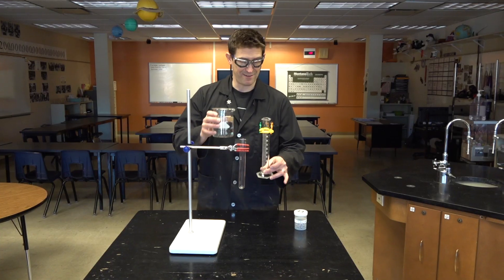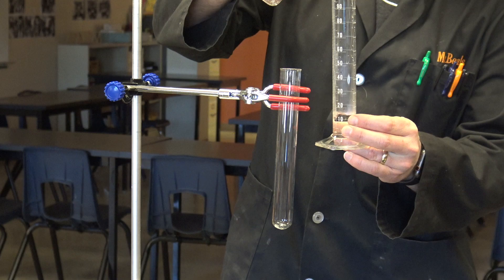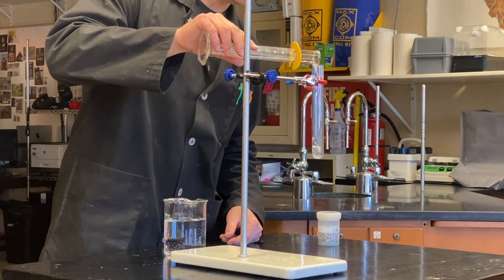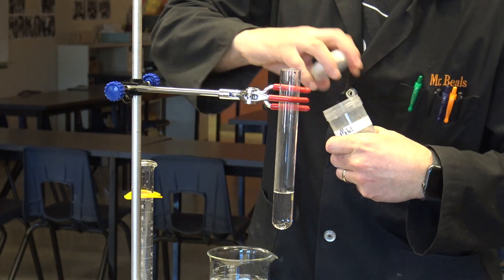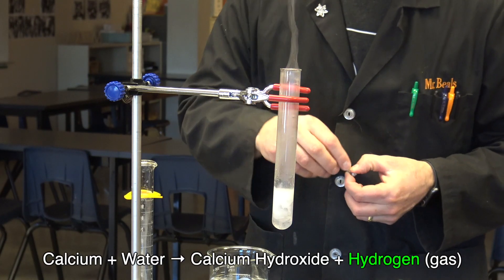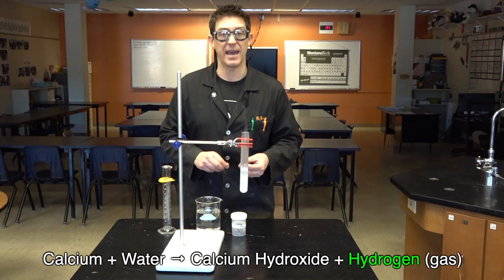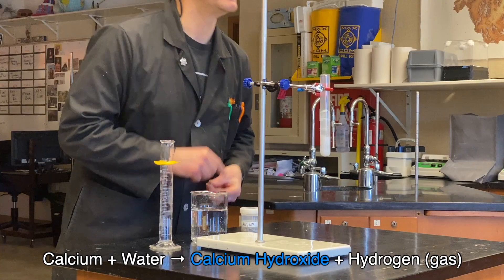I'm going to start off with about 15 milliliters of warm water. The exact amount doesn't matter and the temperature doesn't matter, but you want warm water because the reaction will be too slow otherwise. Then what I'm going to do is add some calcium metal. Look at that — hydrogen gas! As it reacts with the water to produce hydrogen gas, it's also making calcium hydroxide.